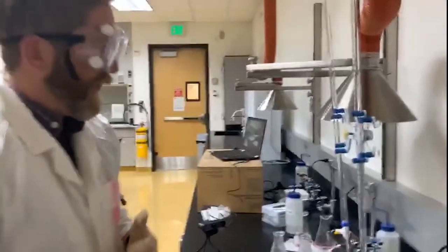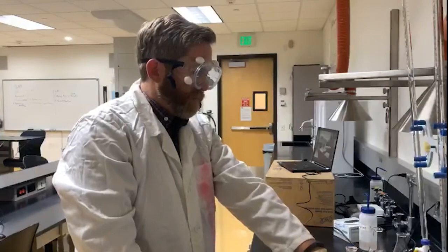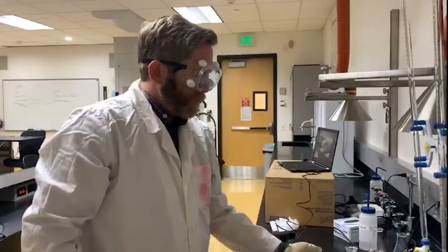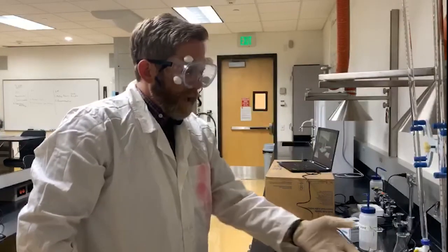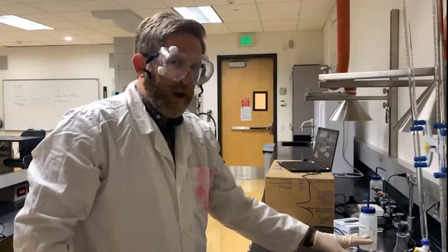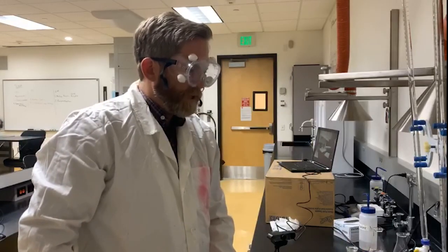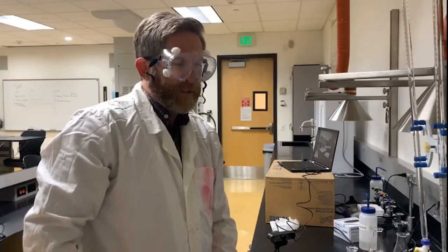Now, one of the things they're going to ask you to do once you've done all your calculations between the bicarbonate and the TUMS is to think about and calculate the relative neutralization capacity. To think about why we take these and don't suck down sodium bicarbonate to neutralize acid when we have an upset stomach. Remember, as you consider that, to consider not only the volume of titrant required, but also the mass involved between the two assays with our sodium bicarbonate versus our TUMS. Different acid neutralizers will also have different efficacies.